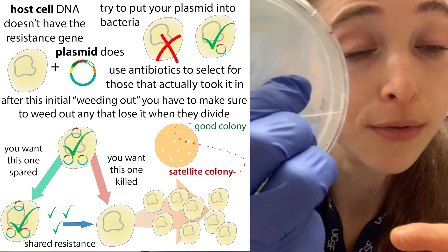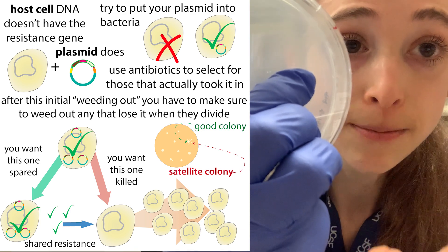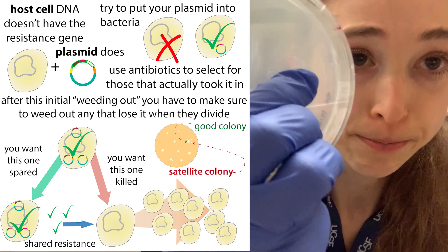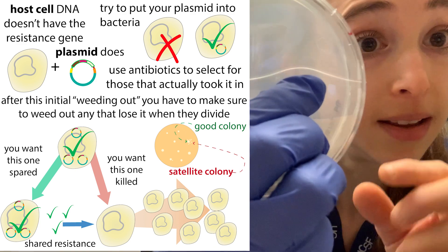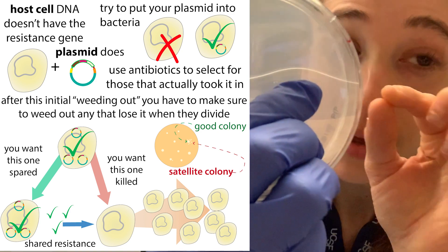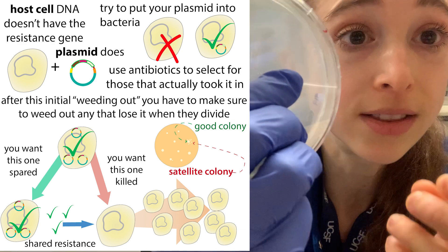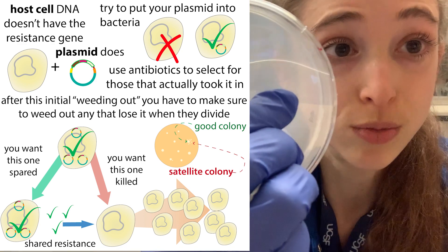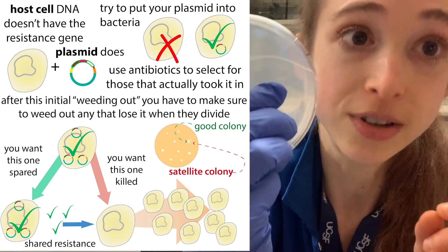To prevent satellite colony formation, you can limit the time you're growing the plates, use fresh antibiotics, and make sure that when you go to choose a colony, you're actually choosing one of the major colonies and not one of those satellite colonies. The longer you grow the plate, the harder it's going to be to tell which is which, so that's another reason to take your plates out of the incubator before it's too late.